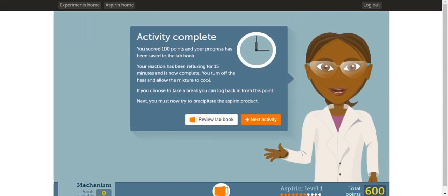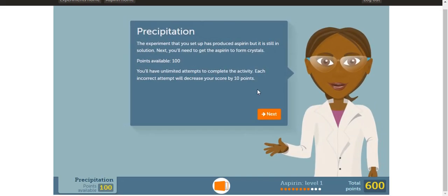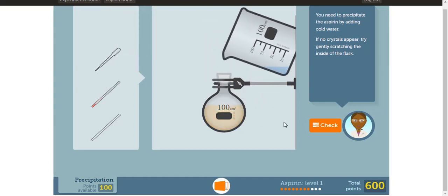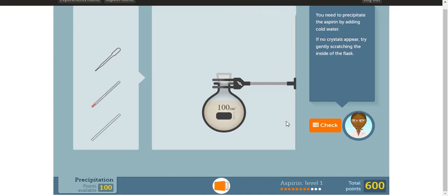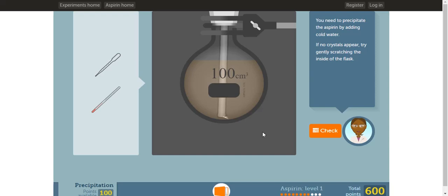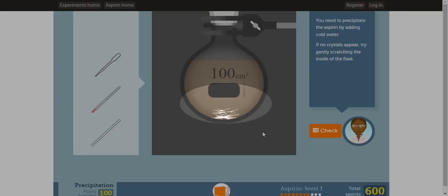In the next activity, the reaction is complete, and now we're going to precipitate the aspirin product. Keep in mind, if you make a mistake, your score will decrease by 10 points. Currently, the aspirin product is dissolved in solution in this round bottom flask. To precipitate the aspirin, we need to add cold water. The purpose of the cold water is to lower the temperature, since solid substances are less soluble at lower temperatures. Since there's no crystals at the moment, we're going to use the glass rod to scratch the inside of the round bottom flask. This will start the crystallization process. Once you see crystals, click check.